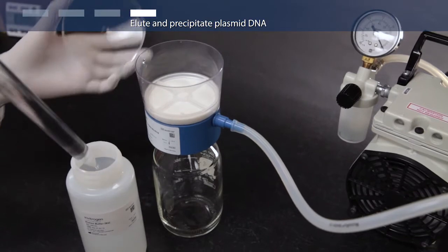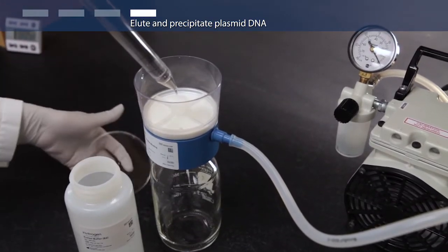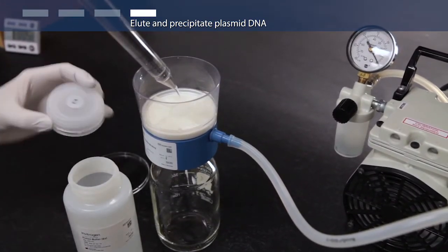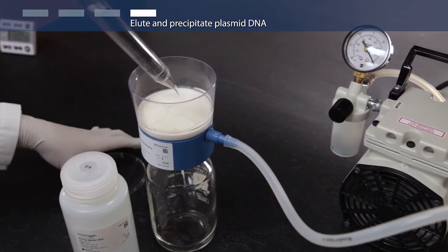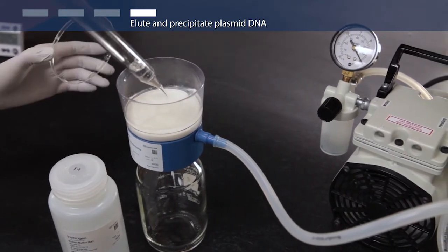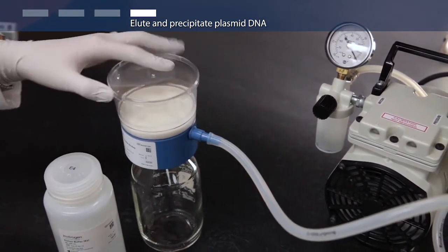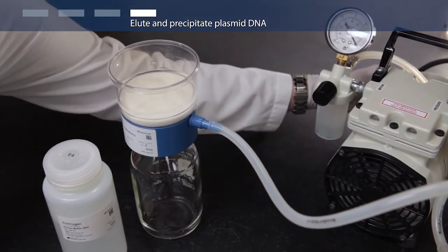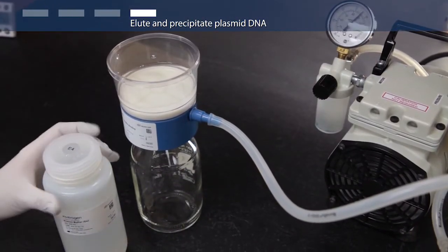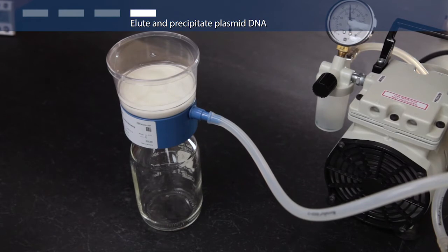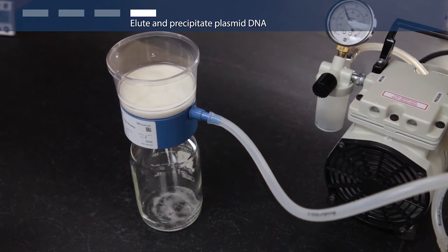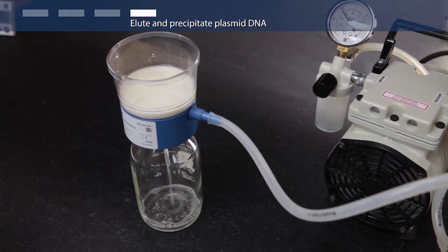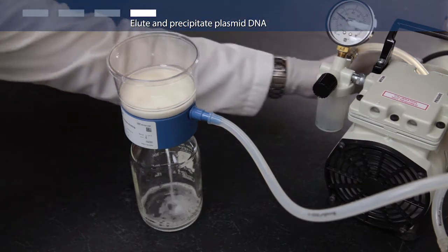To elute your plasmid DNA, first add 50 milliliters of elution buffer to the DNA binding cartridge. Apply a soft vacuum and draw 10 to 20 milliliters of solution. Incubate for one minute. Then again, apply a soft vacuum until all the liquid has passed from the cartridge.